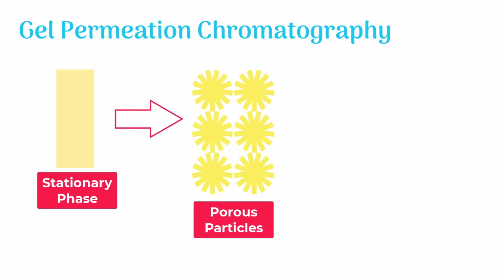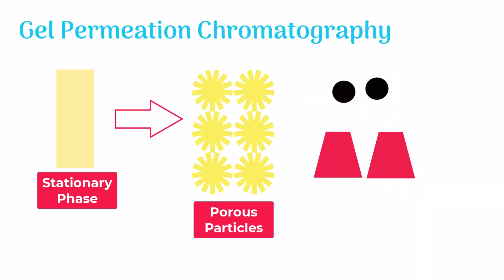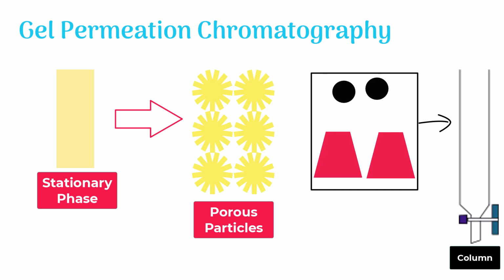Gel permeation chromatography. In gel permeation chromatography, the stationary phase is made up of rigid and highly porous particles. Molecules are separated based on their sizes. The separation occurs inside the column. Let's see how gel permeation chromatography works.